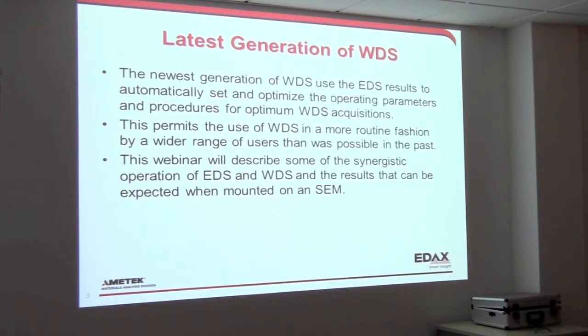So the newest generation of WDS uses the EDS concurrently to work together. The microprobes typically come from the direction of analyzing only with WDS and getting the results that way. They're very highly focused for that, and they're very powerful in doing that, but you have to operate like a WDS operator. Everything's focused for WDS. Most of the users in the audience today aren't experienced in WDS as their primary focus. They're EDS operators, so they would like the WDS to work like an extension of the EDS system. They want the WDS results, but with an EDS mentality, if you will. It doesn't always work, but that's the way they would like it to go.